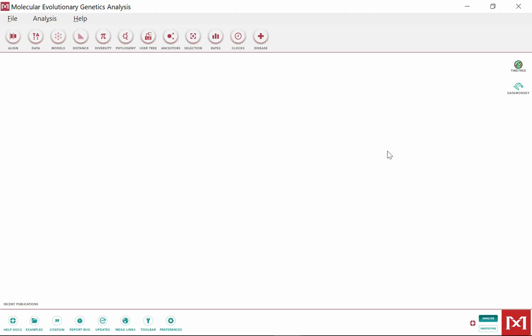What you have to do is two things using the MEGA11 software, which is a compiled software that gives access to different algorithms: aligning algorithms and so on, and phylogenetic algorithms, which allow you to figure out the relationship in terms of time between different organisms. What we're interested in is the alignment algorithm and the phylogenetic algorithms available from this tool. First, we're going to do the alignment.